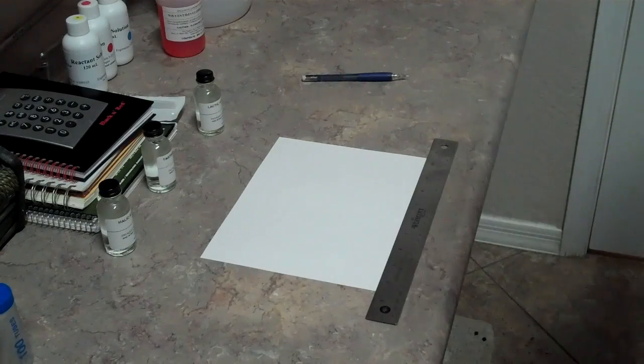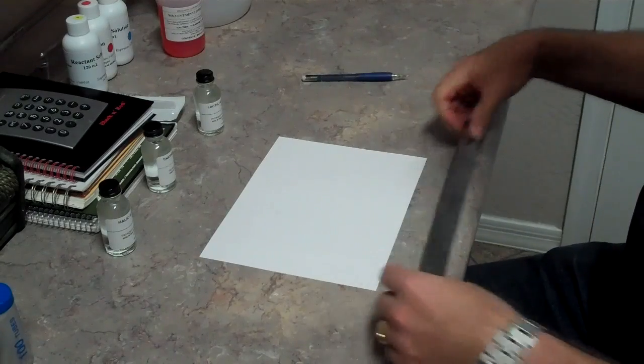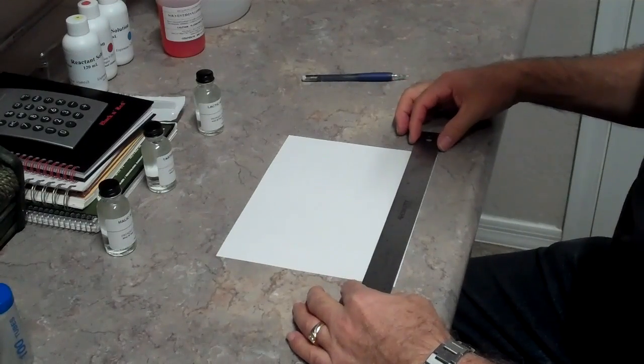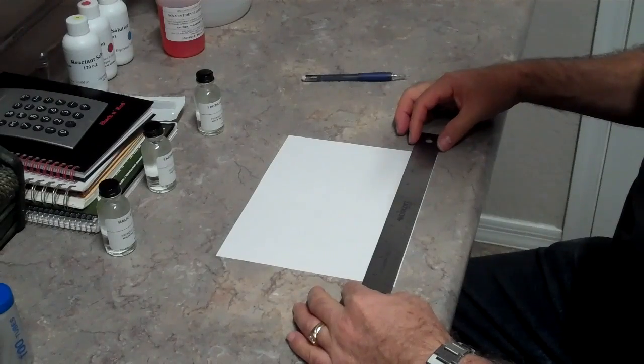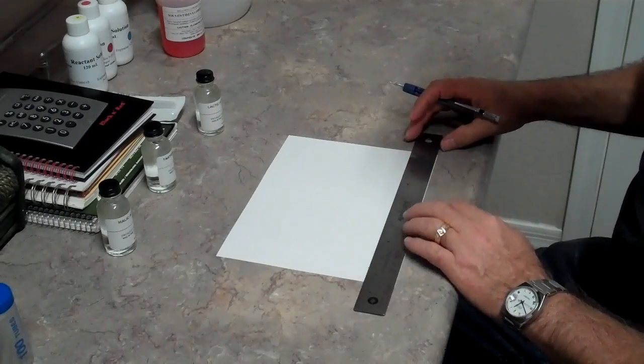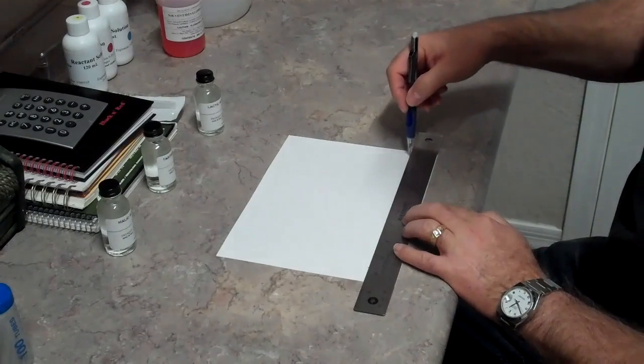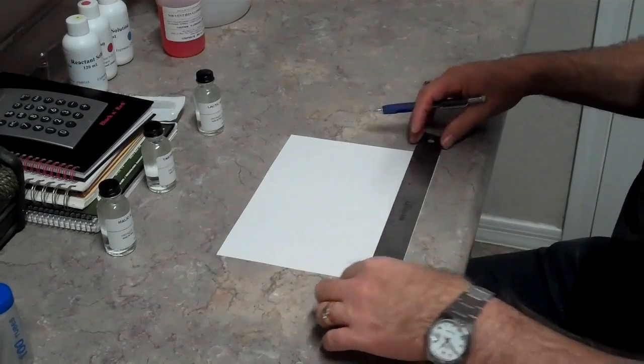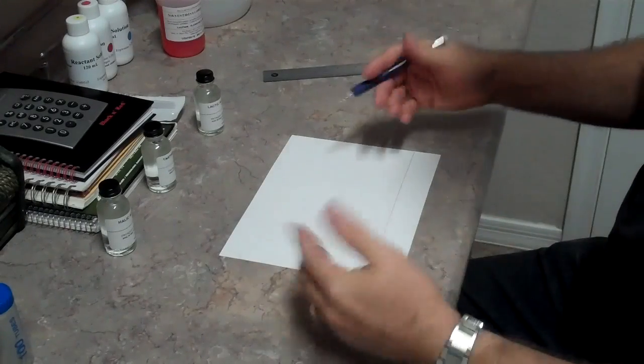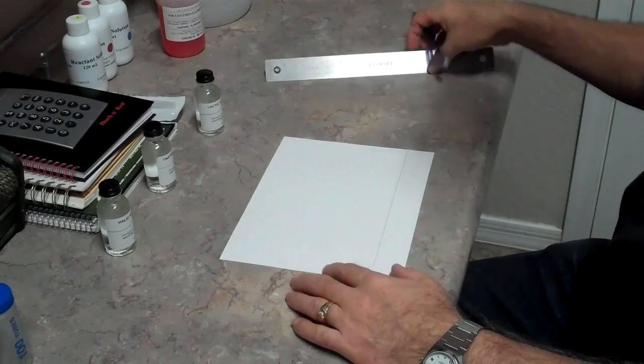So the first thing we're going to do is draw a line across the bottom edge of the chromatography paper, about an inch to an inch and a half, whatever the thickness of your ruler is, in pencil. You don't want to use pen because pen might inhibit the test, but pencil seems to work the best.